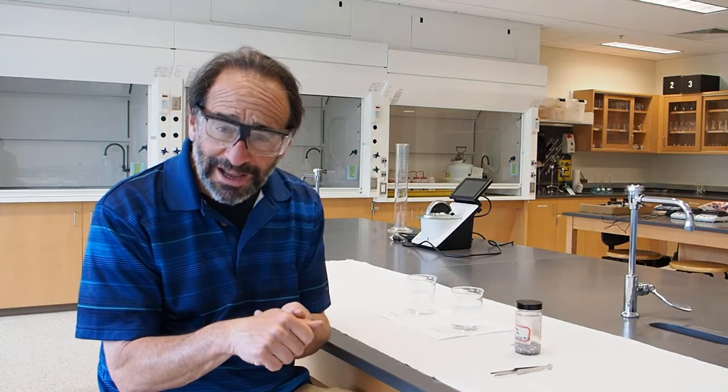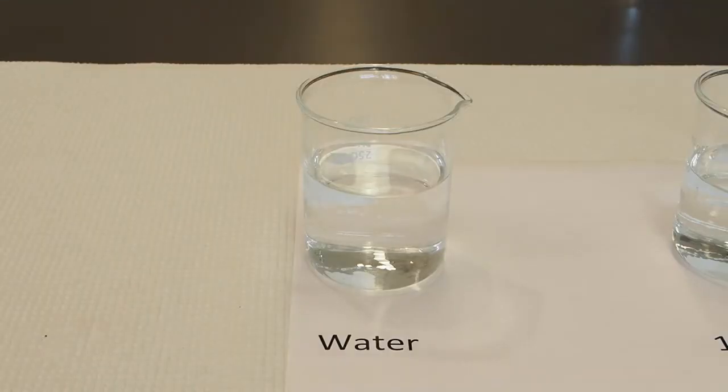So we're going to start out with looking at sodium. Our reagents are going to be water, hydrochloric acid of different concentrations, and nitric acid of different concentrations, as well as, if those don't work, a base to try to dissolve the metal, for which we'll use sodium hydroxide solutions. So we're going to start out by looking at sodium.